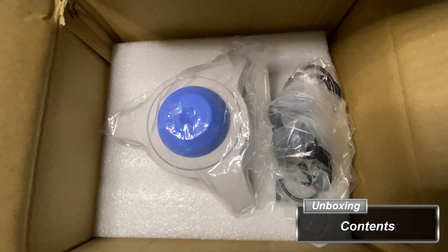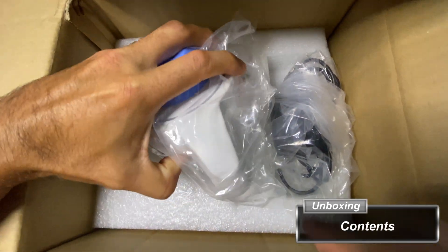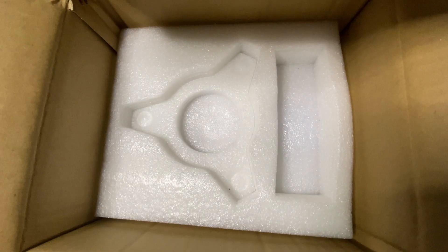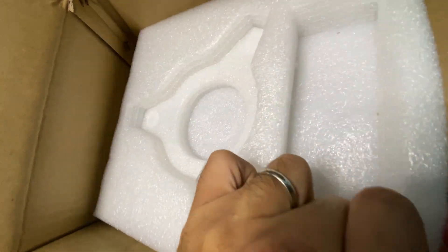The box for the 4E Scientific Lab Vortex Shaker contains the shaker itself, a power cable, and beneath the Styrofoam bedding is the manual, an informational pamphlet, and a replacement rubber head.